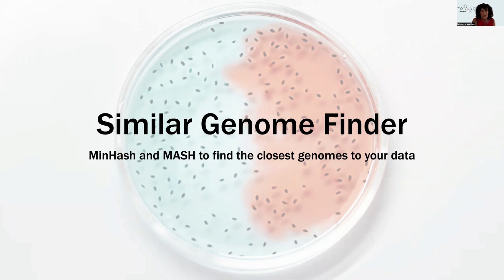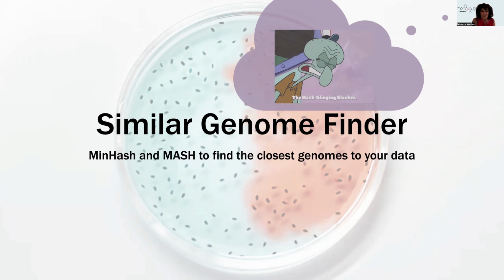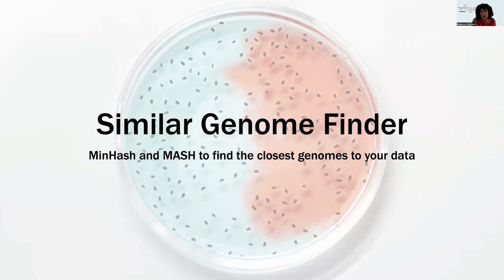Now, you may be thinking, min-hash and mash, what is that? Sounds like something you would do to potatoes. Maybe, but you can also do it to bioinformatic data. So let's do a quick review of what those are.